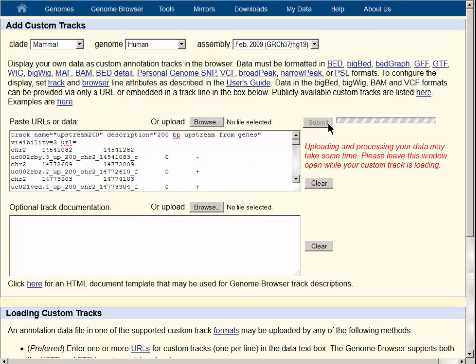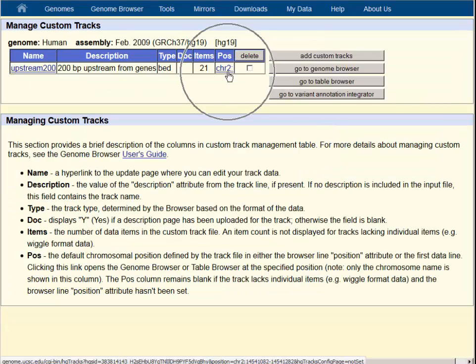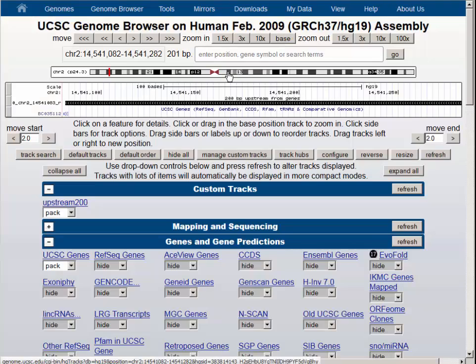The submit button gives us a custom track. Then clicking on the position link takes us to the first item in the custom track.